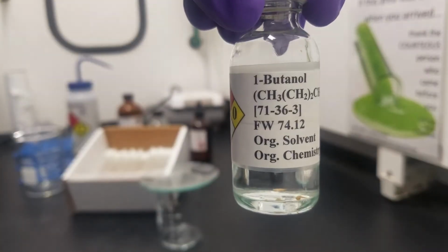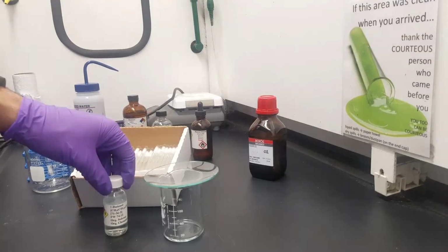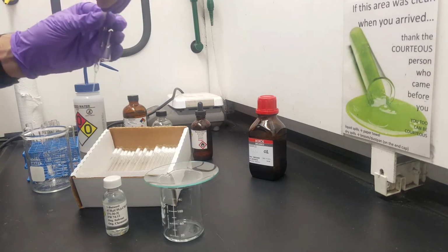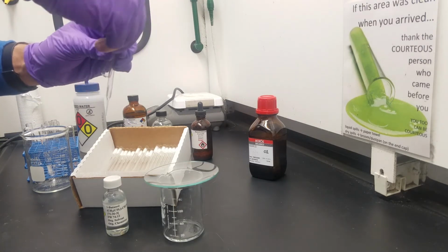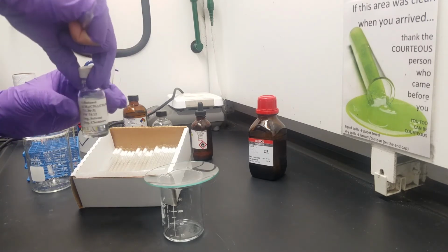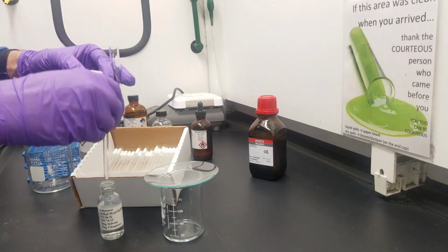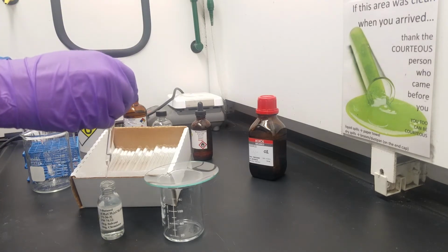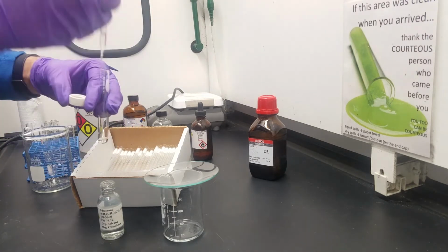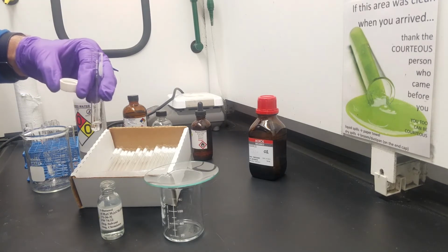Another opportunity to just kind of talk for a second here. You'll notice that our methanol and the one we're not testing explicitly here because we did it earlier with ethanol are just written as the name. But when we look at butanol, it said 1-butanol. And if you remember back and think about it when we watch the octanol part, the butanol and octanol both have a 1 in front. That's the nomenclature system to refer to the exact location in the carbon chain where the alcohol functional group is located, that OH.